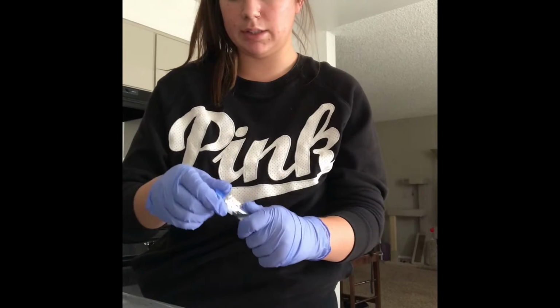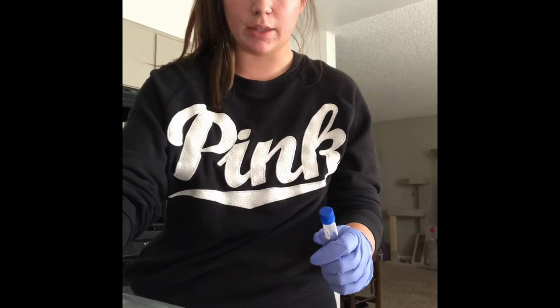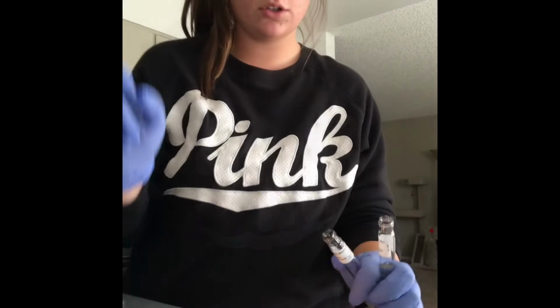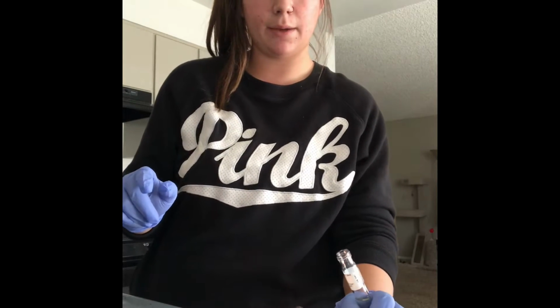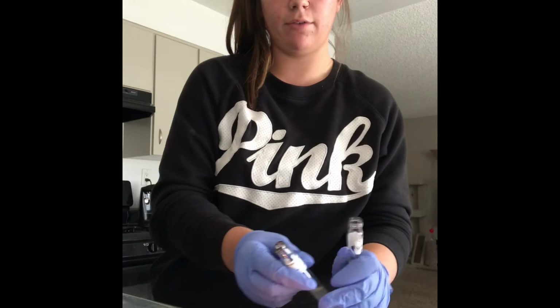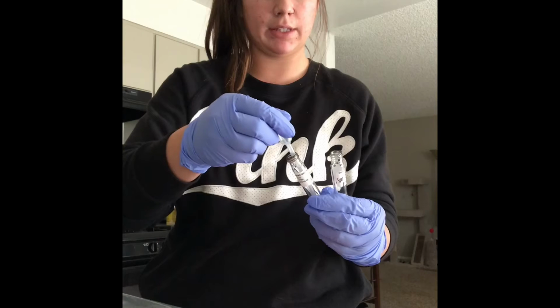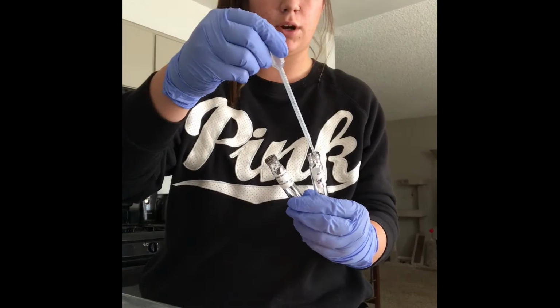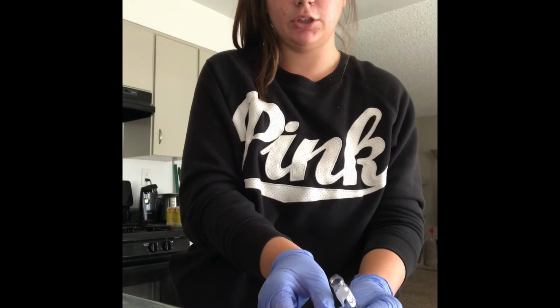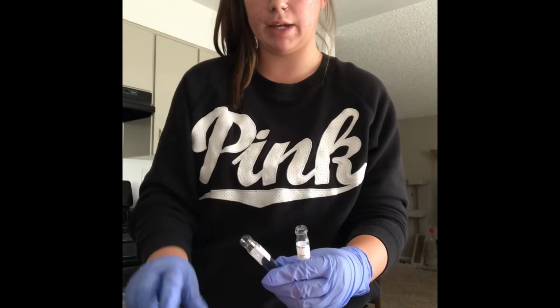set this one to the side, and then just repeat the same steps for pH 7 and 9. So I'm just going to sterilize S-epi right here and my S-epi pH of 5 right here. I have my dried pipette. I'm going to take my S-epi and place 2 drops, 1, 2, into my S-epi pH of 5. Just going to sterilize this and sterilize this, and then replace both of my caps on here.